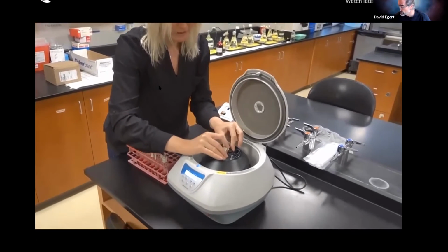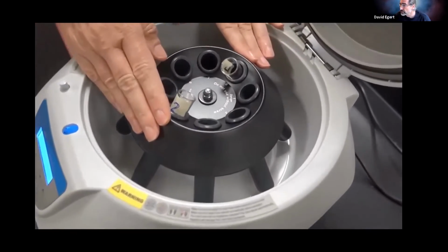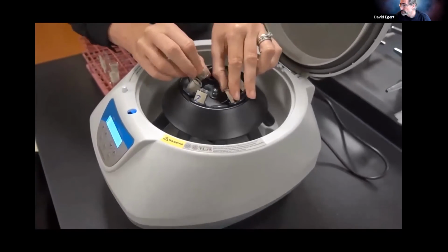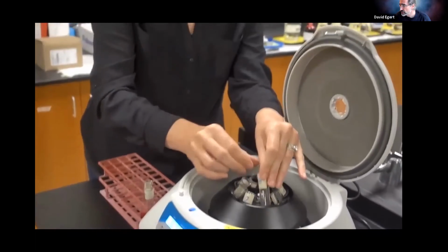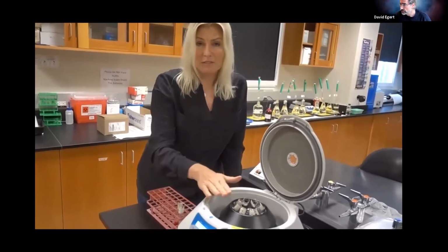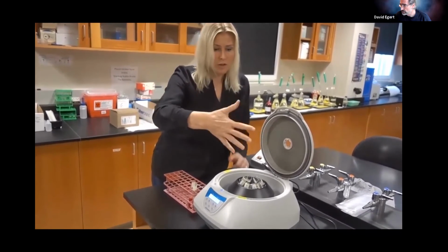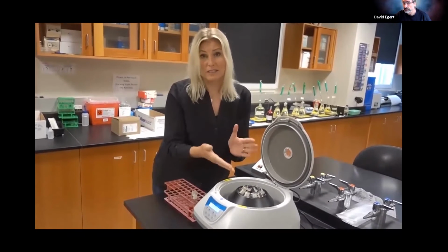Just stick things right across. If I were to only do 2 tubes, this would be balanced, and then I just keep adding tubes across from each other. As long as they are the same volume, they have the same weight, and everything should be fine. I do not need to cover the test tubes with parafilm or anything like that, because you can see that they're slanted, angled out, and the centrifugal force moves everything out and downward. So there should not be any risk of anything spilling over.